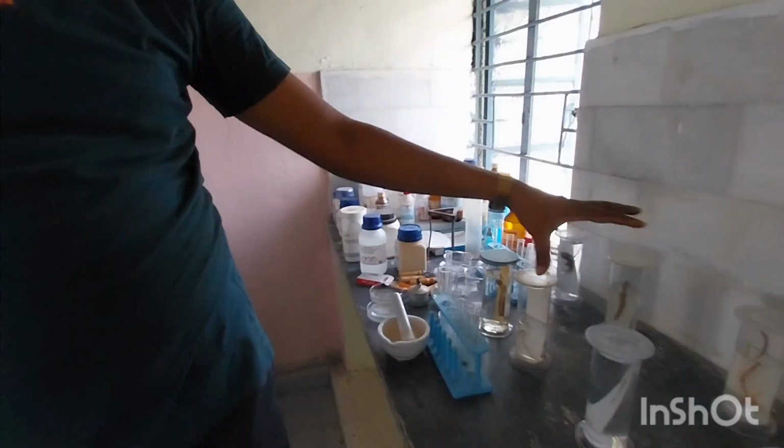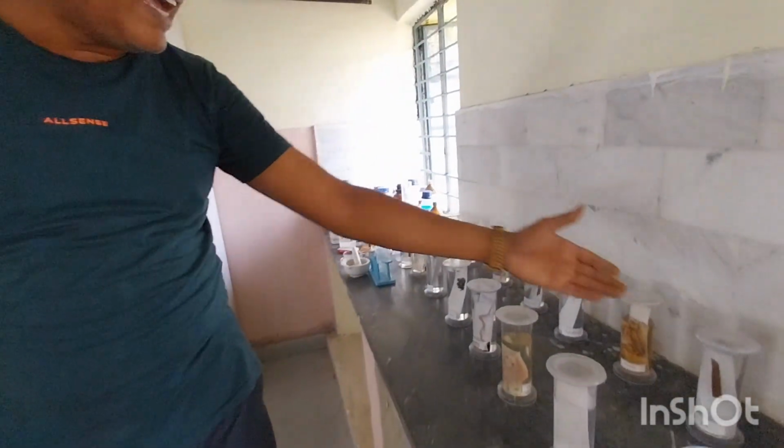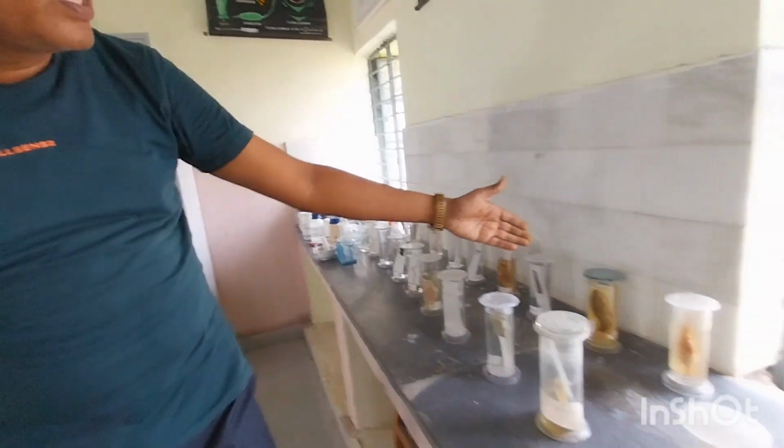Here you can see the specimens. Different types of biological specimens here. Merkensia, typha, plants, fish, okay, a prawn.